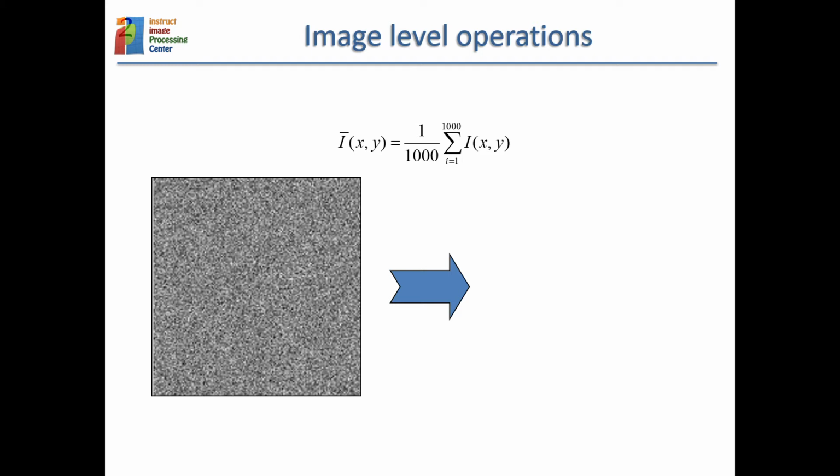Turns out that the images we collect from the electron microscope are very noisy. There are many different sources of noise, and one of the most important is the ice layer in which the samples are embedded. So basically what we are seeing here is the structure of the ice on top, and in the middle the structure of our particle that we are interested in.